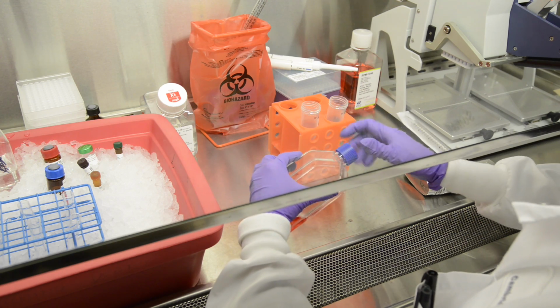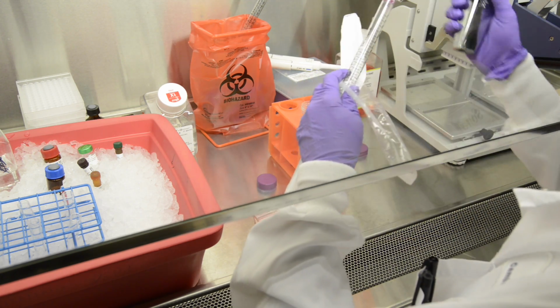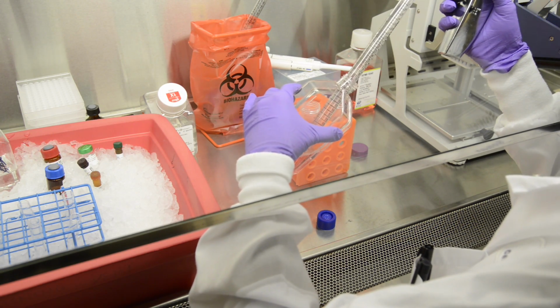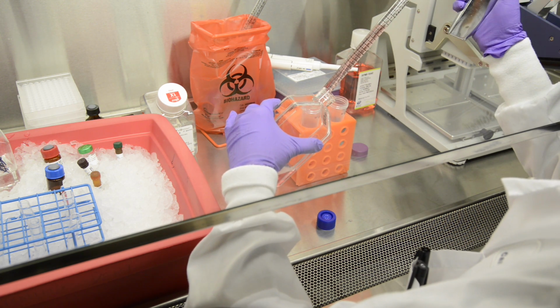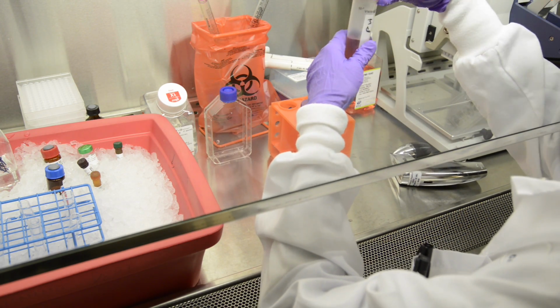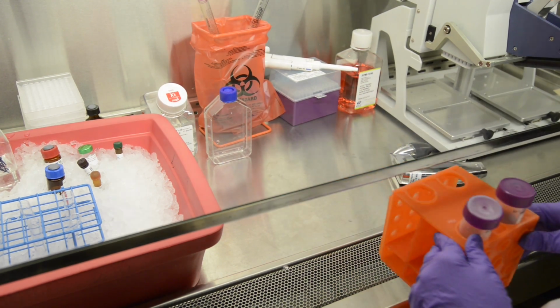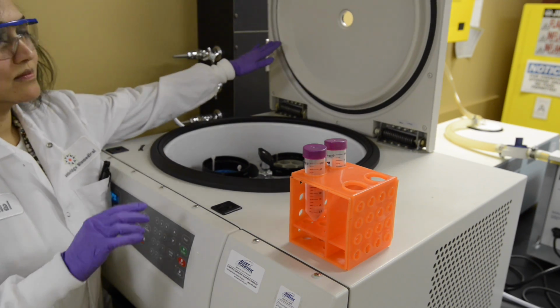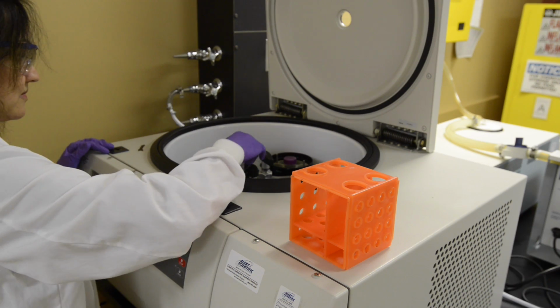This is the start of the sample processing part of the assay, where we split cells in the cell culture biosafety cabinet. Here we pipette suspension cells into 50 ml Falcon tubes for centrifugation. Here we are programming the centrifuge to spin the cells at the required speed and temperature for 5 minutes. We will stain the resulting cell pellets with FACS antibodies.